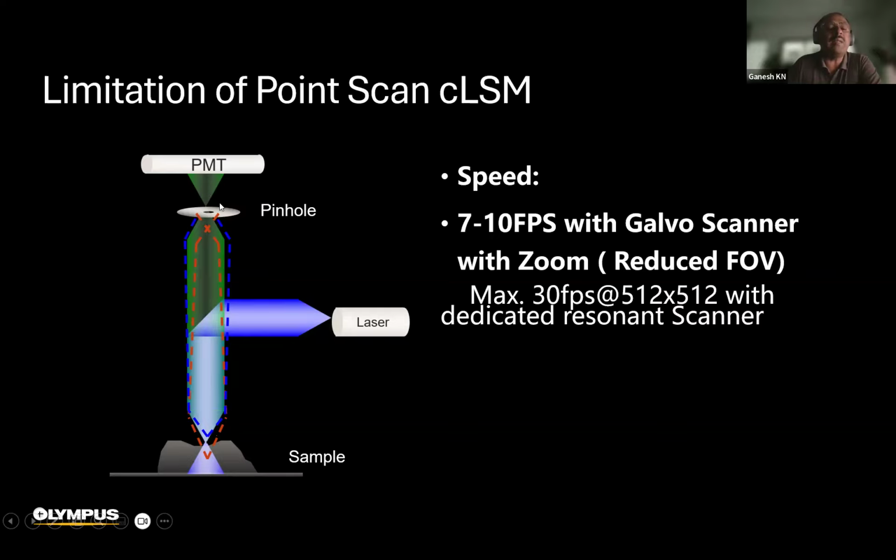So there was a greater amount of loss in the point scanning confocal microscope because of the poorer detector. Compared to the conventional camera that we use in the wide field fluorescence microscope, the quantum efficiency, or sensitivity, can range from 70 to 90%. That means it has an ability to collect more signal given an opportunity to collect the signal from the specimen. So the camera was considered a wonderful tool for high speed, highly sensitive imaging, but it cannot be used with a point excitation source.